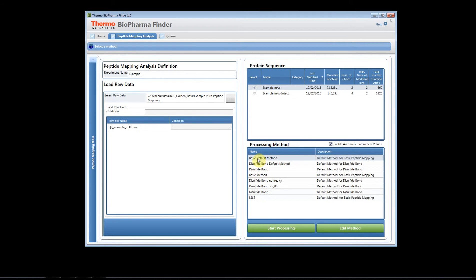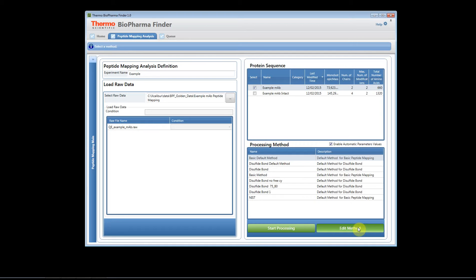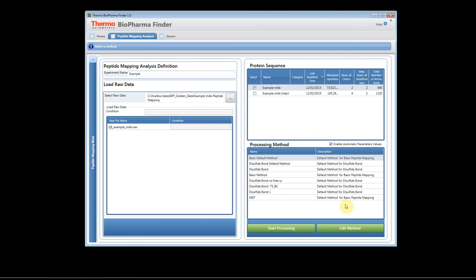This would be a basic default method where I'd like to start and I usually like to edit my method when I begin my experiment because I want to take a look at the parameters and make sure that they're set appropriately for my data set. I might want to raise or lower the threshold value, change the enzyme, or change some of the other identification parameters in the method.